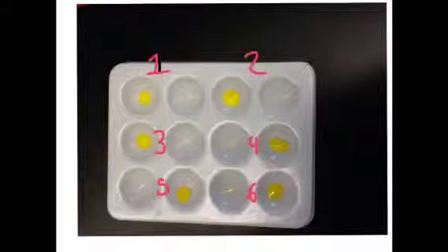After we added each spot plate sample, we added either Pb(NO3)2, which is lead nitrate, or sodium iodide to each one. So we added lead nitrate to the first spot of each one.